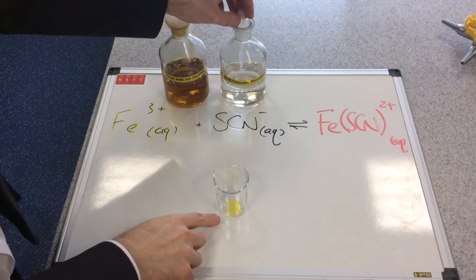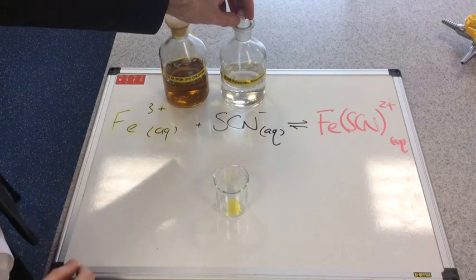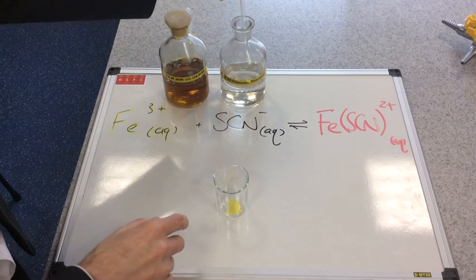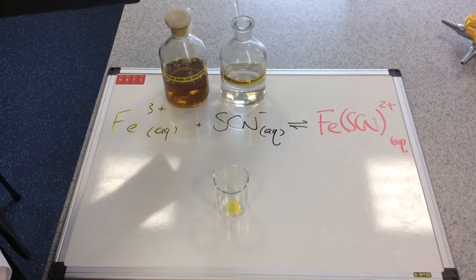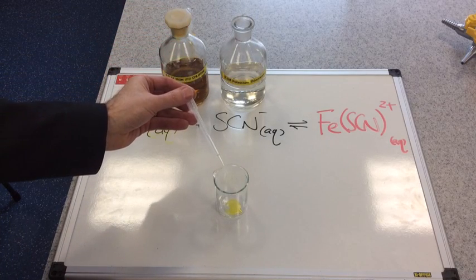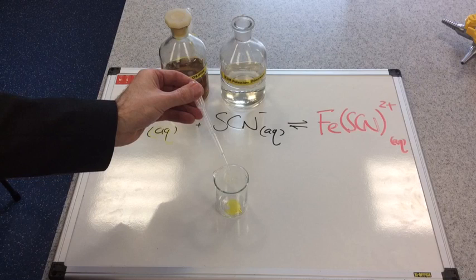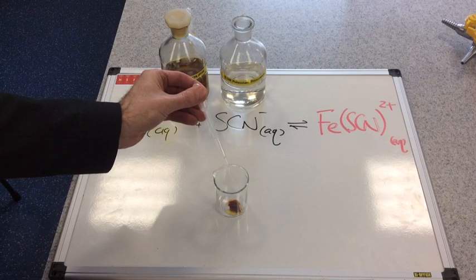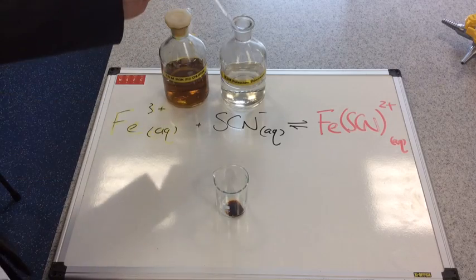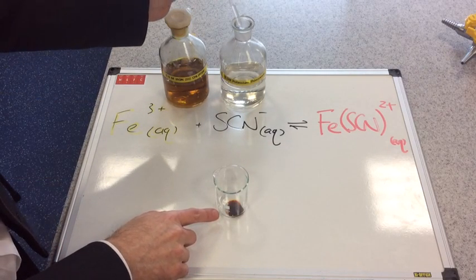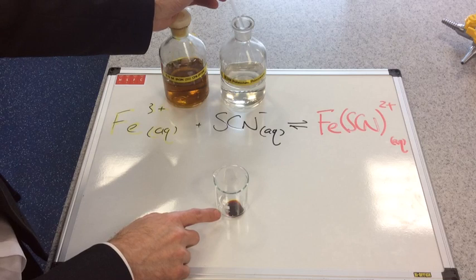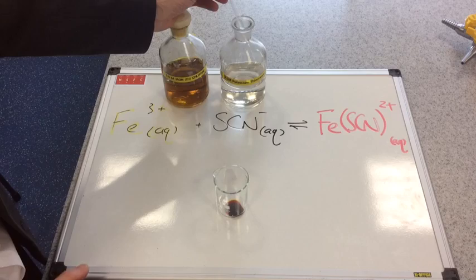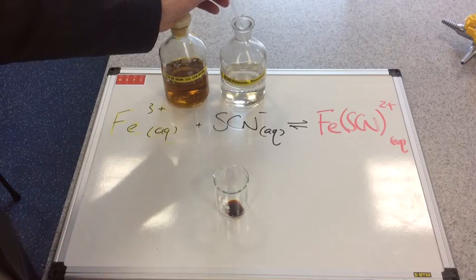You can see from the beaker I've already introduced a small amount of iron 3 plus ions, you can just see the yellow at the bottom of the beaker, and to this I'm going to add a few drops of the thiocyanate ion. It's going that deep red color so I'll put about five or six drops in there and I'm going to top this up with distilled water and then split this solution into five equal parts.